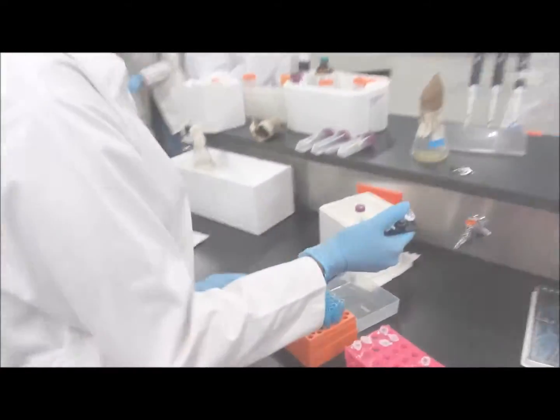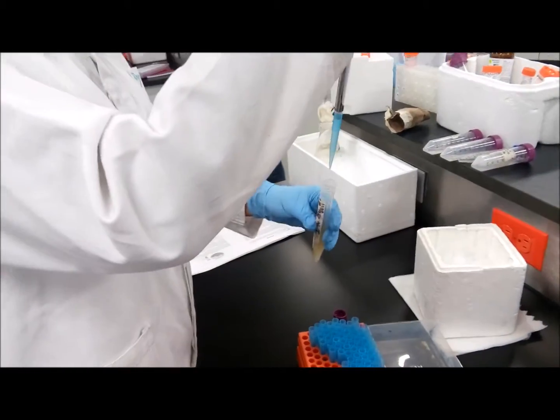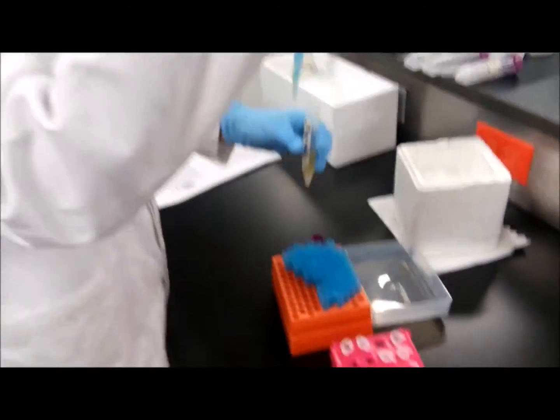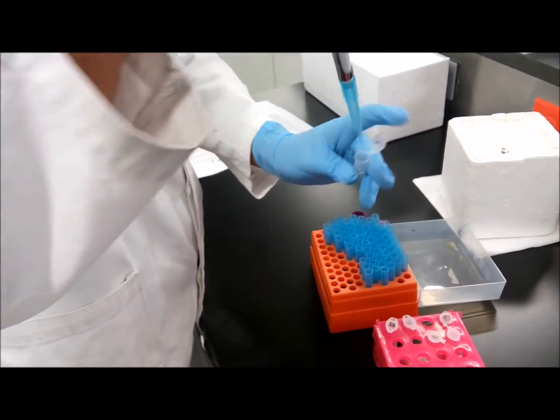For the work with commercial kits, it is necessary to extract the DNA from the matrix. The process consists in different phases of extraction and purification. The first step is the lysis of the cell, in which there are necessary compounds such as salts to break the structure of macromolecules and the SDS detergent to eliminate the cell's membrane. Then, the degradation of the proteins interfering the sample of DNA with a protease enzyme.